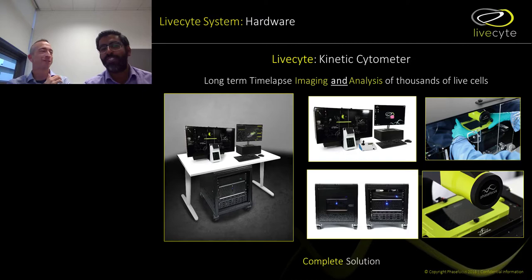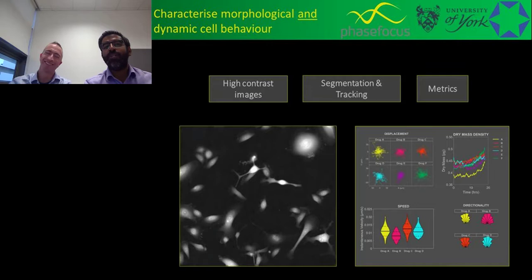But what I do want to talk to you about is what we can do with the images. We've got that high contrast image that Peter's talked about. But I want to show you next how we can take that high contrast image, perform the segmentation and the tracking, and turn it into metrics.